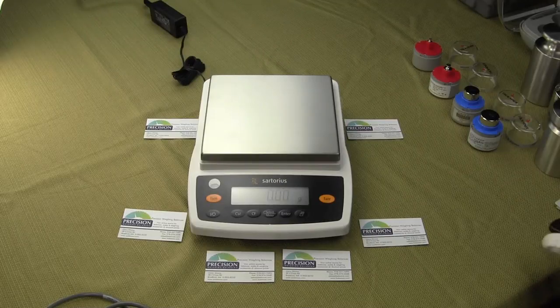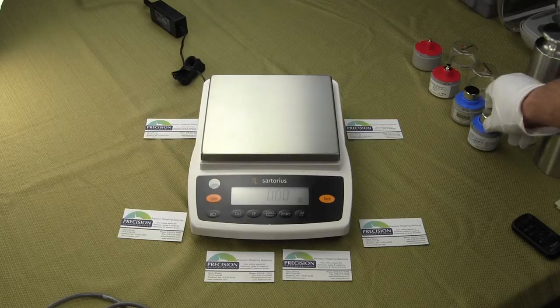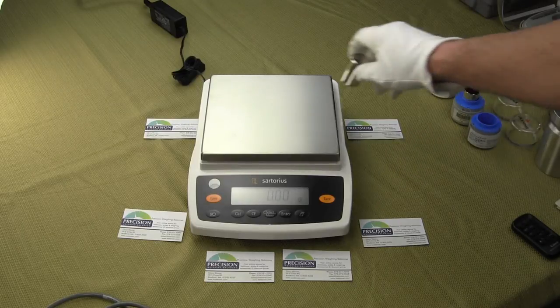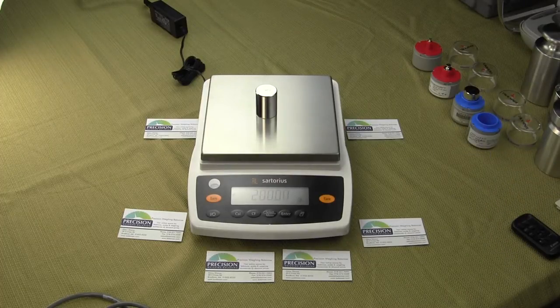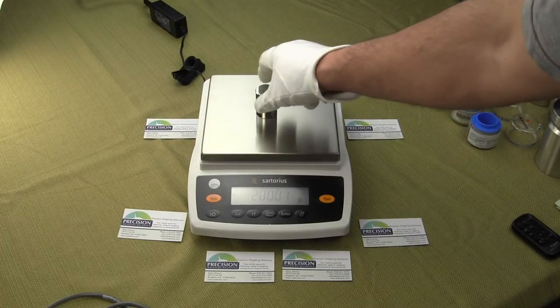Welcome to Precision Weighing Balances. In this demonstration we're going to be reviewing the new Sartorius Entrance Series. This new lab balance series is now available as of March 2014.